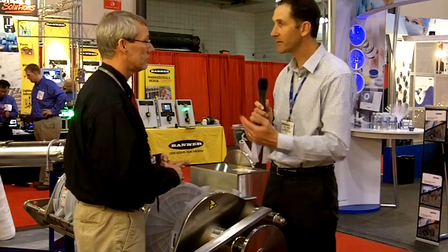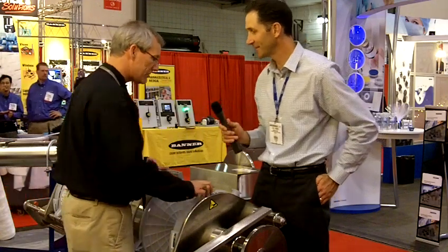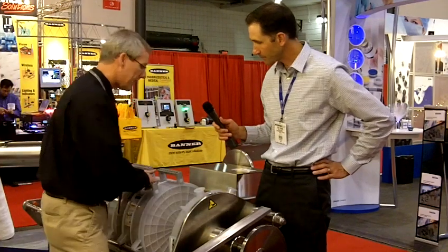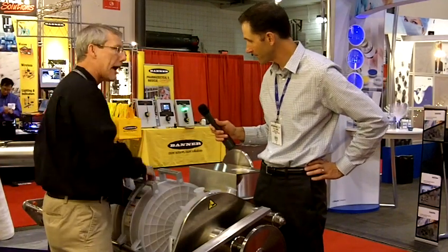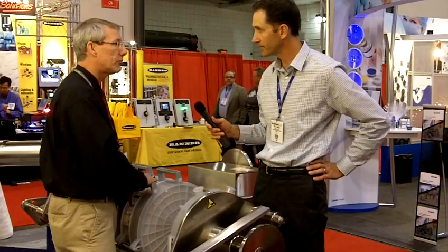Why don't we go ahead and have a demonstration here? If you don't mind following along, I'll show you how this is done. All right, we start with a bottom manifold — we're going to put that in the bottom. We're going to put four capsules on our stack today. It goes anywhere from one to four capsules in one or two stages. Today, we're doing four capsules with one stage.